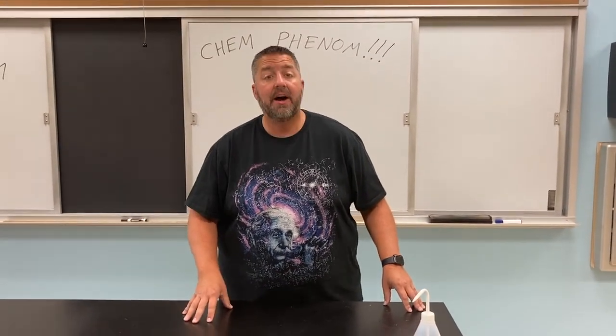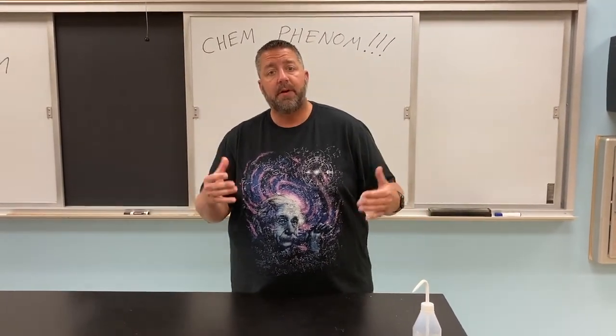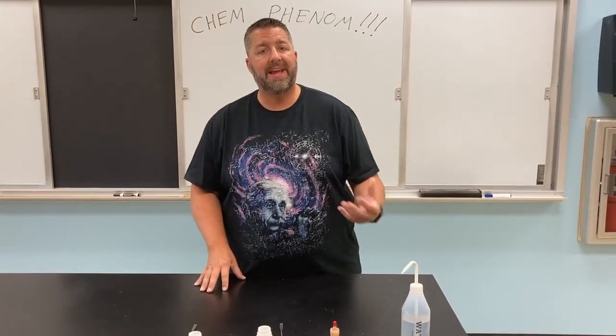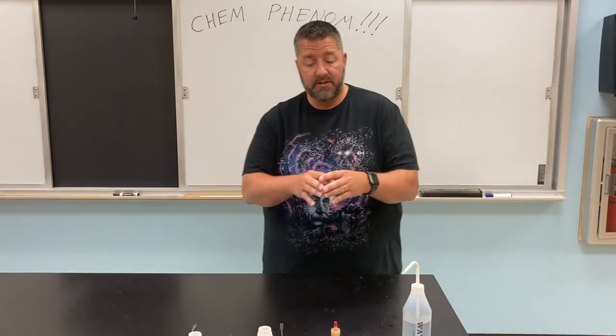Very good. Today, we're going to do a little experiment. It's a virtual experiment because we have no other choice, but we're going to do a little experiment called the Chem Phenom, where we're going to put together a bunch of chemicals.